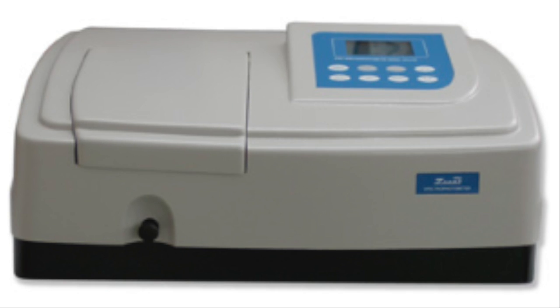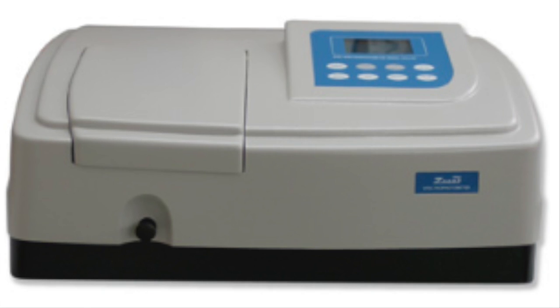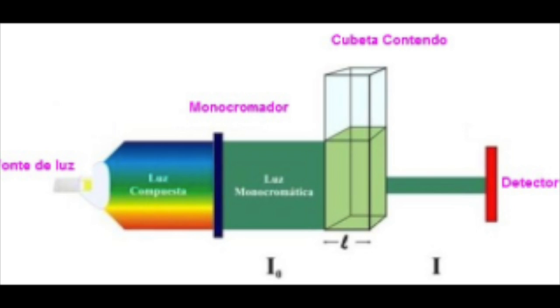There are different methods to quantify nucleic acids. Spectrophotometry: we can confirm a sufficient amount of nucleic acids by measuring absorbance. Readings range from 0.1 to 1, and an absorbance of 1 unit at 260 nanometers corresponds to 50 micrograms of DNA per milliliter.